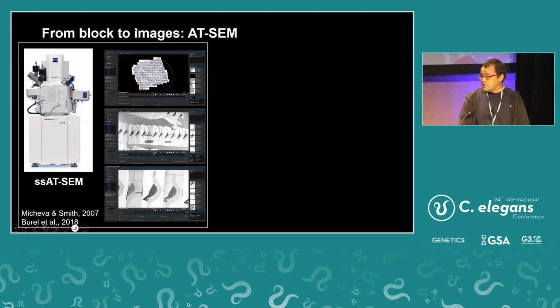So we use Irina's variant of array tomography SEM. So we have this 4x3 centimeter silicon wafer. And I cut a whole worm onto this wafer. And we can go put it in our microscope, go to the ribbons and sections, and we basically just draw boxes around our region of interest, spend a couple of hours doing that, then click play and go home, and the microscope does all of the work for you.